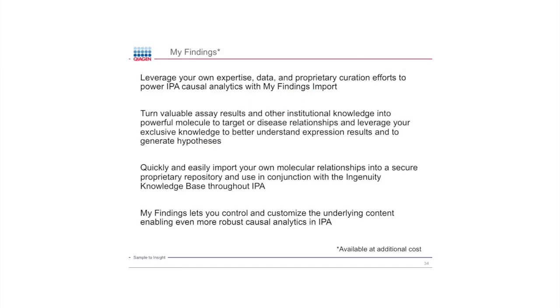Okay, and this is basically the last topic. We have another capability in IPA called My Findings, which is available for additional cost, but it lets you put your own findings into IPA and use them in your analyses.